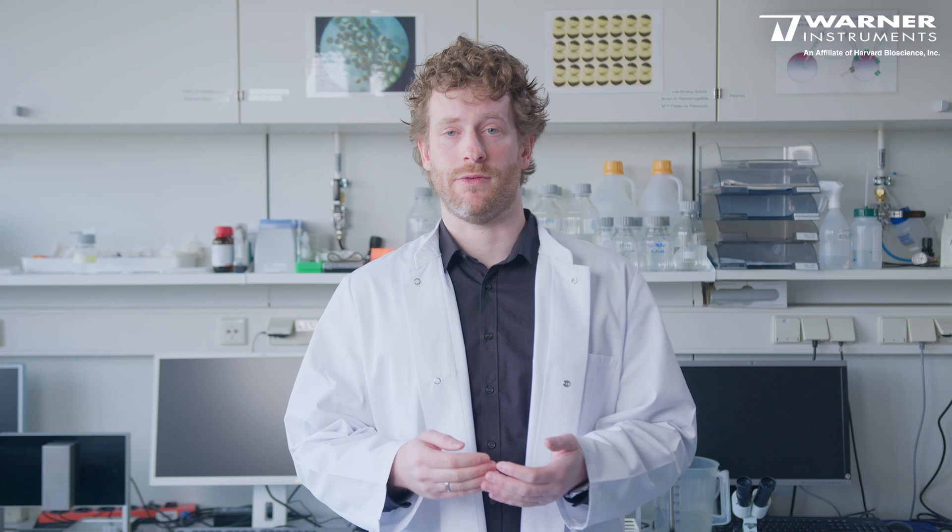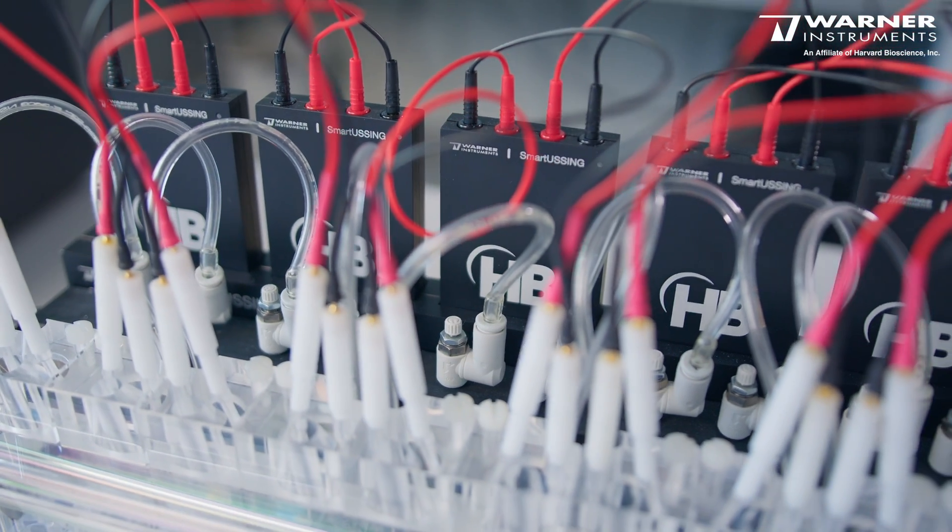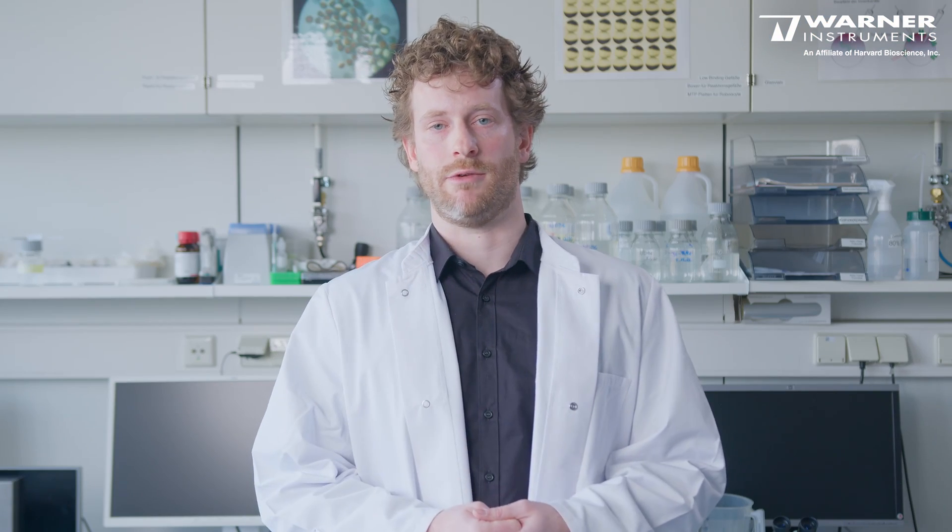Anyone who has ever attempted to manually calibrate a set of amplifiers knows that it's easy to make mistakes, and those mistakes will result in errors in your data, costing time and money if you have to repeat the experiment. The Smart Ussing system eliminates this risk because all calibration settings and adjustments are saved directly together with your data recordings.